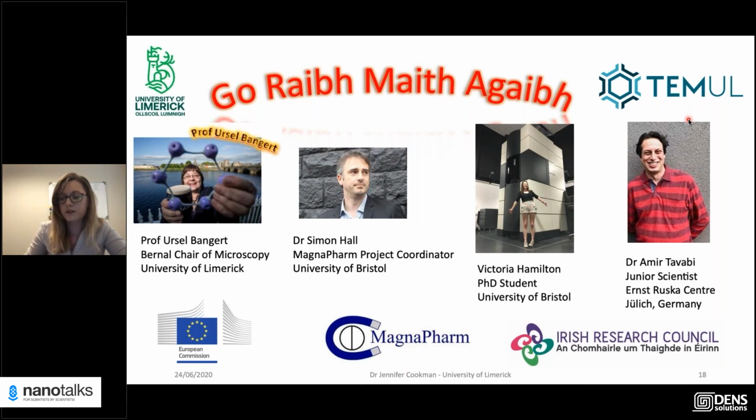I understand, and there's one additional thing that I didn't mention in my presentation, but it is known as well that the electron beam can cause nanoparticles to be attracted to the electron beam. There have been a number of studies on small and large nanoparticles where they would be in a completely different area, but when you condense the electron beam, they will be attracted to it in a liquid environment. So that's another contributing factor that we'd have to consider as well. Thank you.